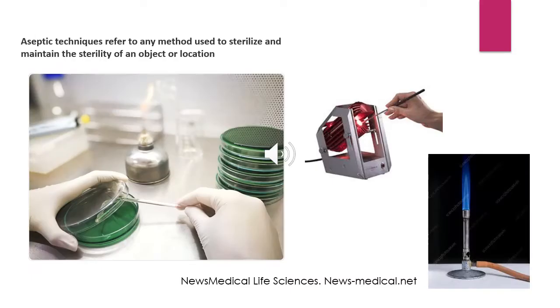Okay, some tips also in doing the isolation technique is to observe aseptic technique. Work near a Bunsen burner or within a biological safety cabinet. A Bunsen burner creates an upward flow of air, lowering the dust and other contaminants from entering the sterile media.